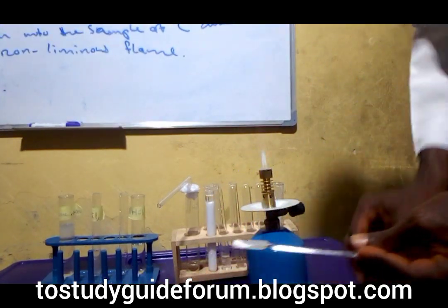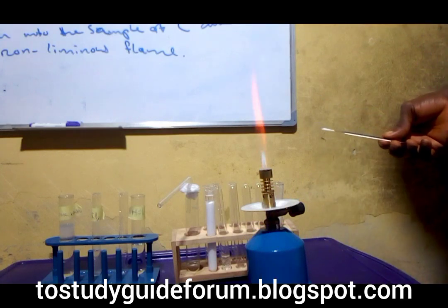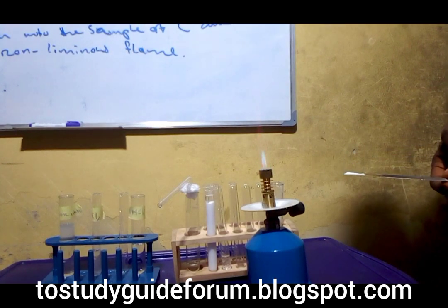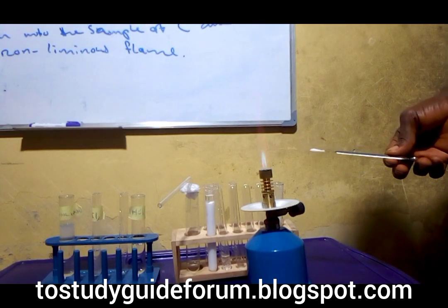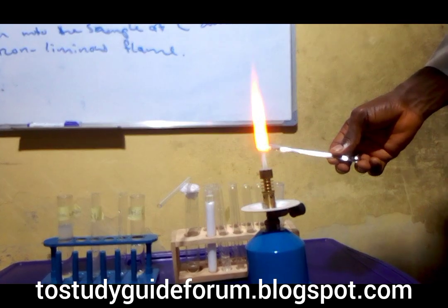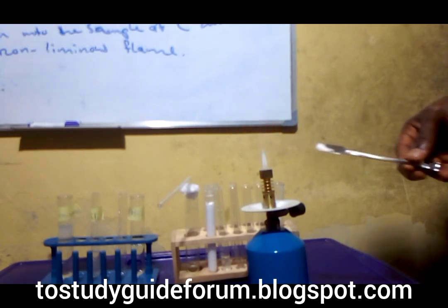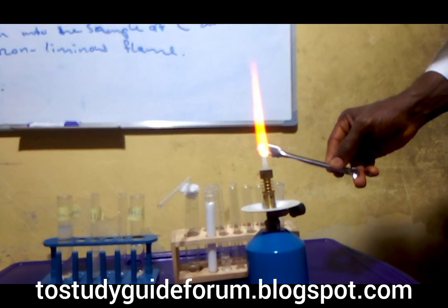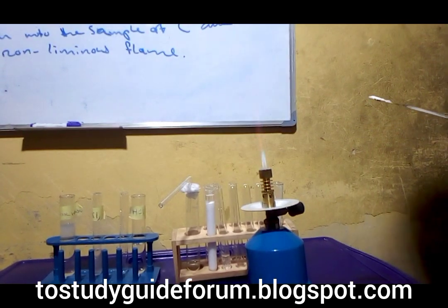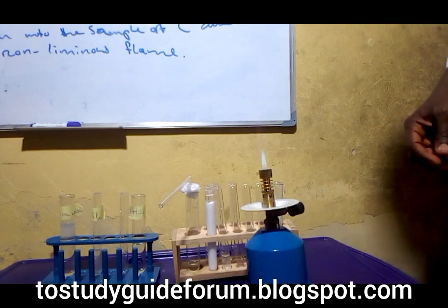We have the sample of our salts. Notice the golden yellow color that is coming out. The golden yellow color confirms the presence of sodium ion. The sodium ion is what is forming this color, which means sodium ion is confirmed. That means sodium ion is present in this.